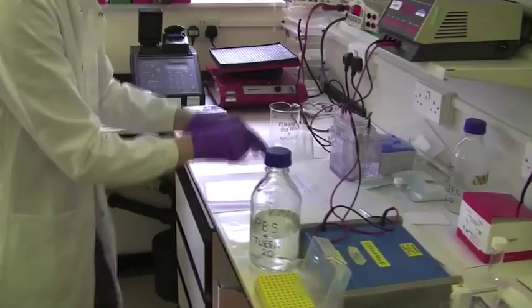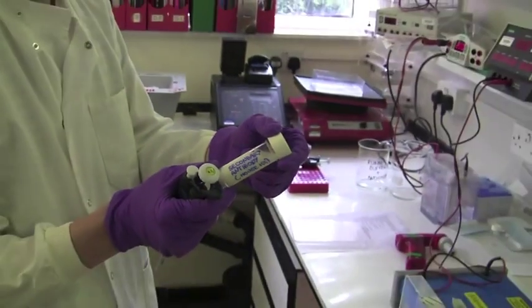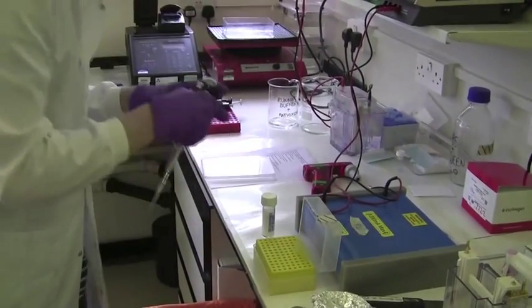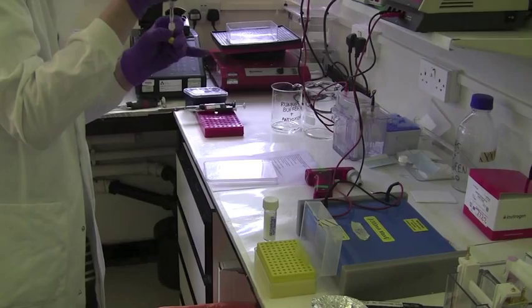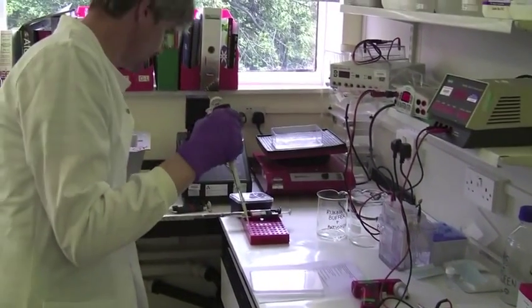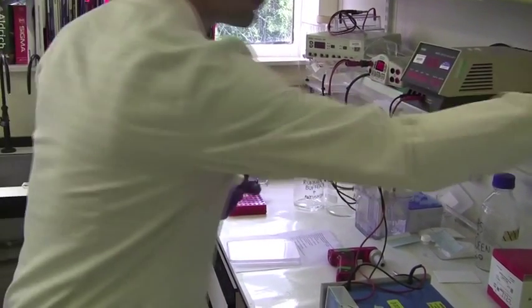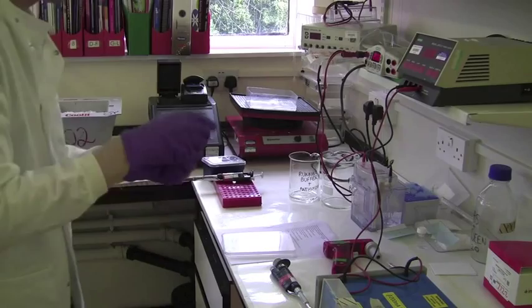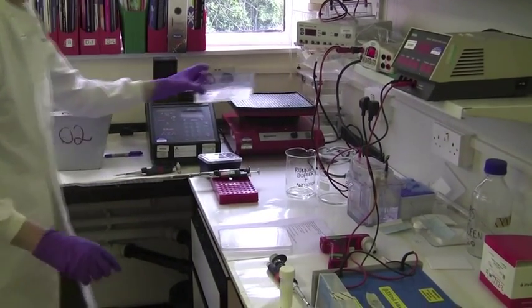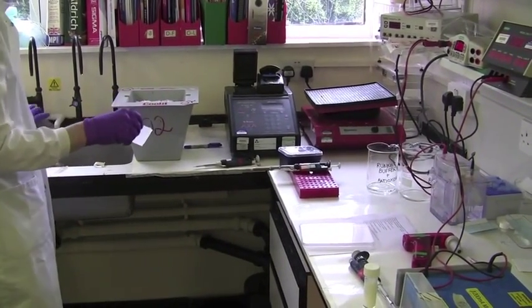Most primary antibodies used for Western blotting are not detectable directly, and therefore secondary antibodies, which are complexed to an enzyme, are usually used in the detection process. The choice of secondary antibody will be determined by the species of animal in which the primary antibody was raised. The other consideration in the choice of secondary antibody will be the detection system, which is to be used to visualize the protein of interest, and this will determine the enzyme or tag which is complexed with the secondary antibody.